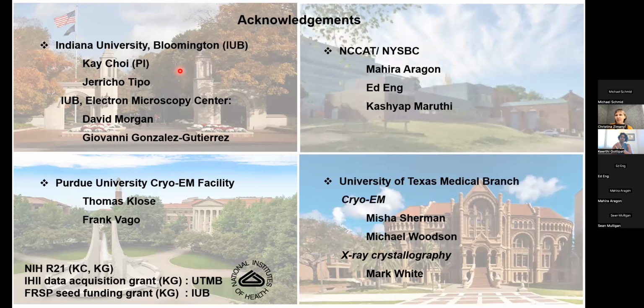I don't know whether it's because these are different views that CryoSparc is not aligning that well, or it's just particles that, I don't know what these short classes are, but we did look at them, we did try to refine them, but we're not seeing anything meaningful out of them.